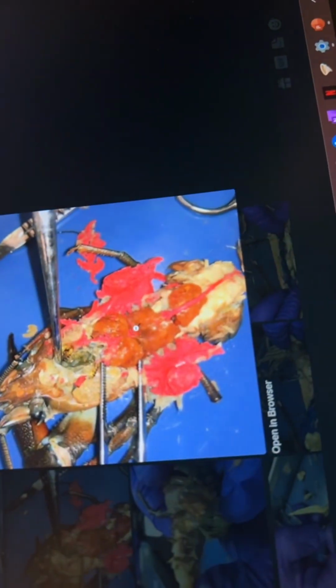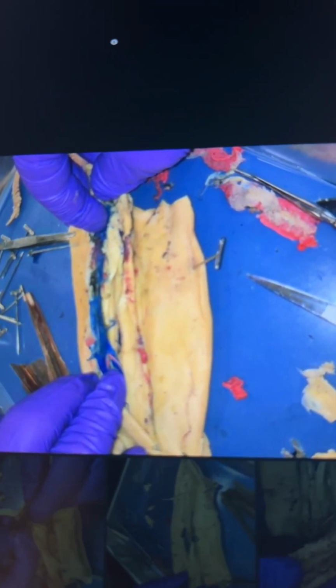We had this weird, unidentifiable mass that kind of tore up and destroyed the insides, and this is kind of what we were left with. You kind of see some of these structures in here, but basically the crayfish is going to have an open circulatory system with a heart that's located here in this thorax area, about right here, and it's actually going to be pumping something called hemolymph, and this is what the crayfish's blood is, and it's going to fill in spaces surrounding the organs, and this is what's going to facilitate that gas exchange. We're actually going to see that the gills, you can see them here, are attached to the walking legs, so as the legs walk, it's actually going to be causing the passing of water through the gills, better increasing gas exchange. Next, we're going to look at the circulatory system that is in the squid.